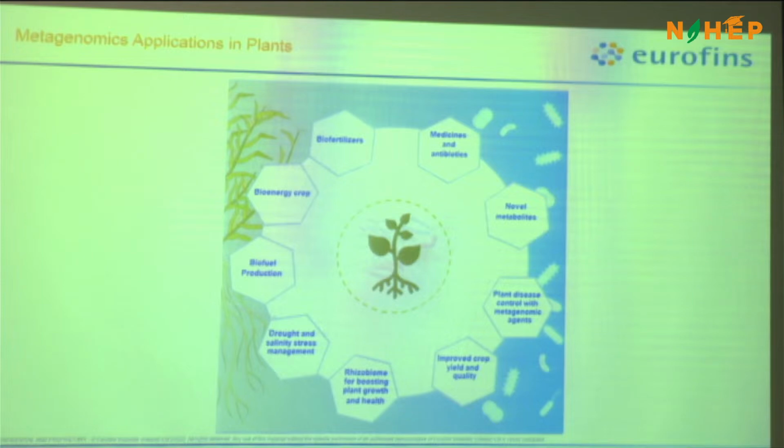But yes, there are drawbacks in this as well, because we are dependent on databases like Silva or Greengenes, which are the Bibles for the databases from where we are picking up the annotation of the microorganisms. Some of the microorganisms in those are written as unclassified, but no names are given. So we will have an unclassified bacteria, but we don't know which bacteria it is. Sometimes the top hit is an uncultured bacteria. So these are certain drawbacks of this platform also. But still we can identify novel ones, the rare ones, the top abundant ones, and so on.